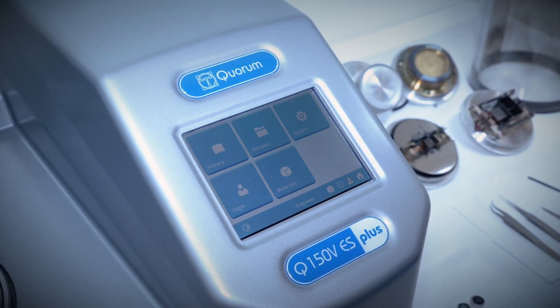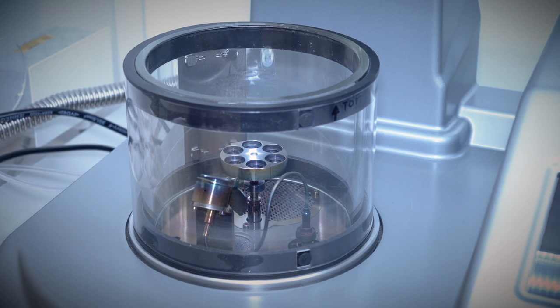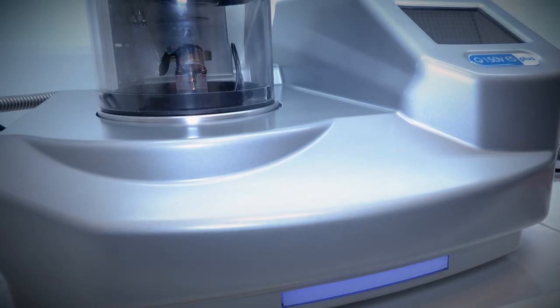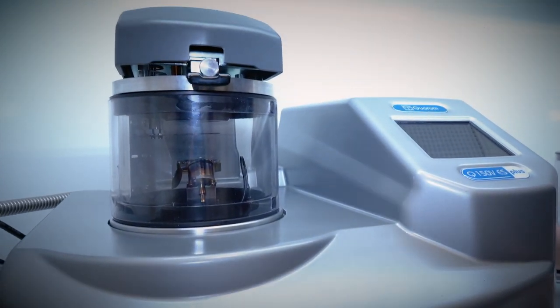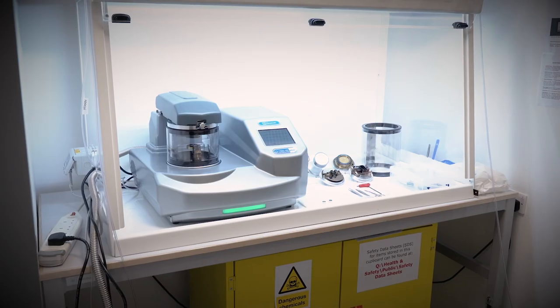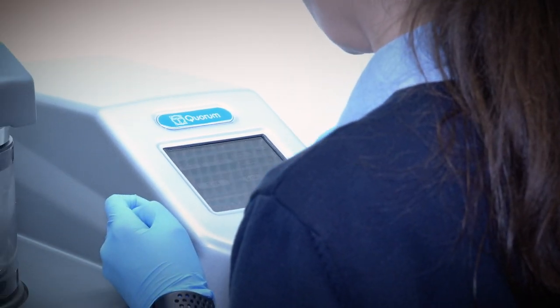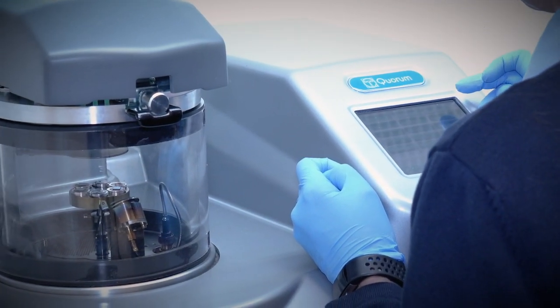The Q150 V Plus is optimized for high vacuum applications with an ultimate vacuum of 1×10 to the minus 6 millibar. The lower background pressure removes oxygen, nitrogen and water vapor from the chamber, avoiding chemical reactions during the sputter process which could otherwise lead to impurities or defects in the coatings.